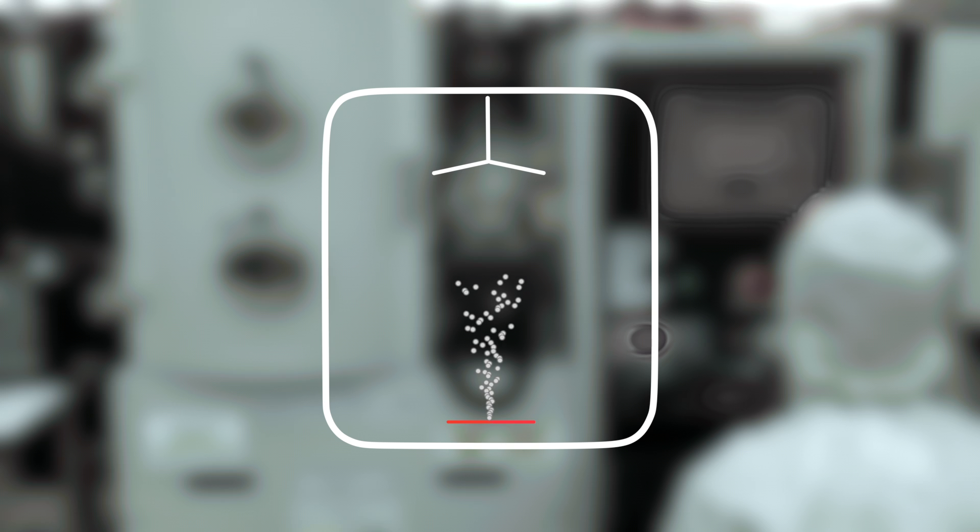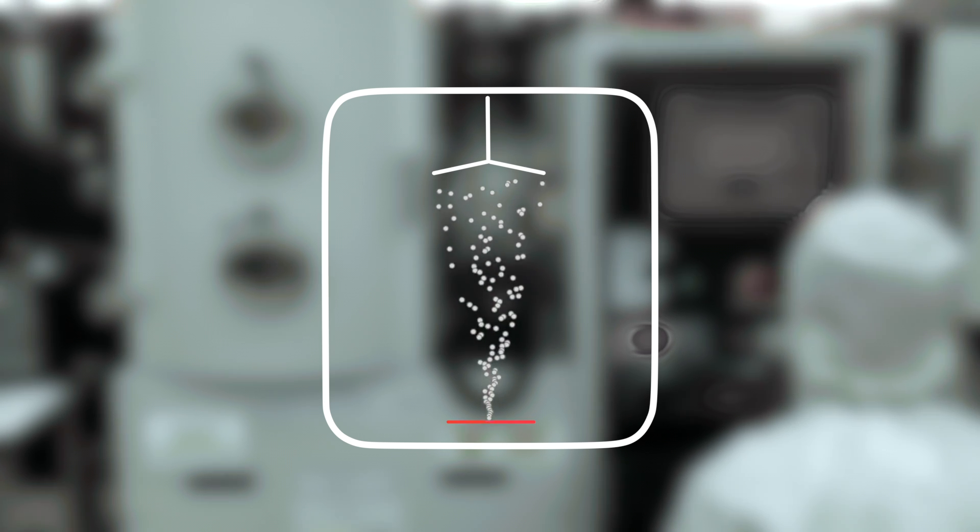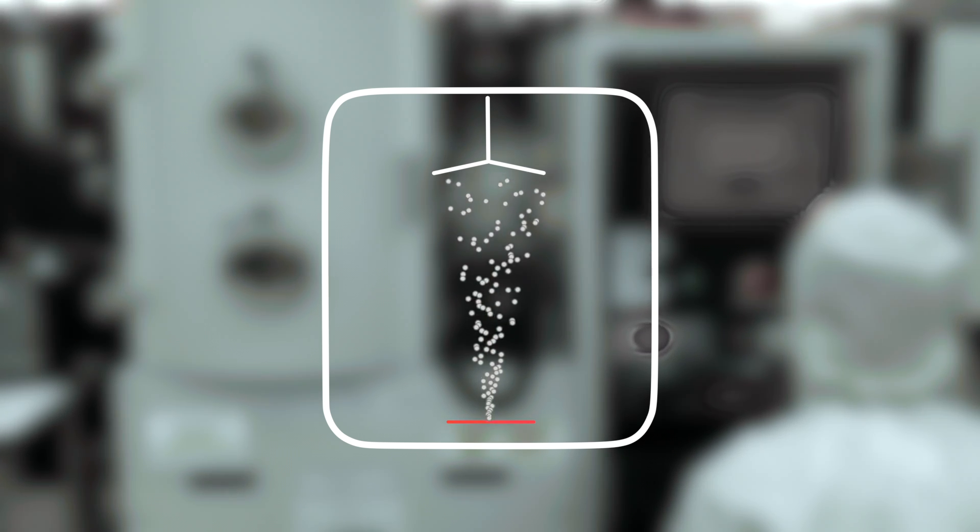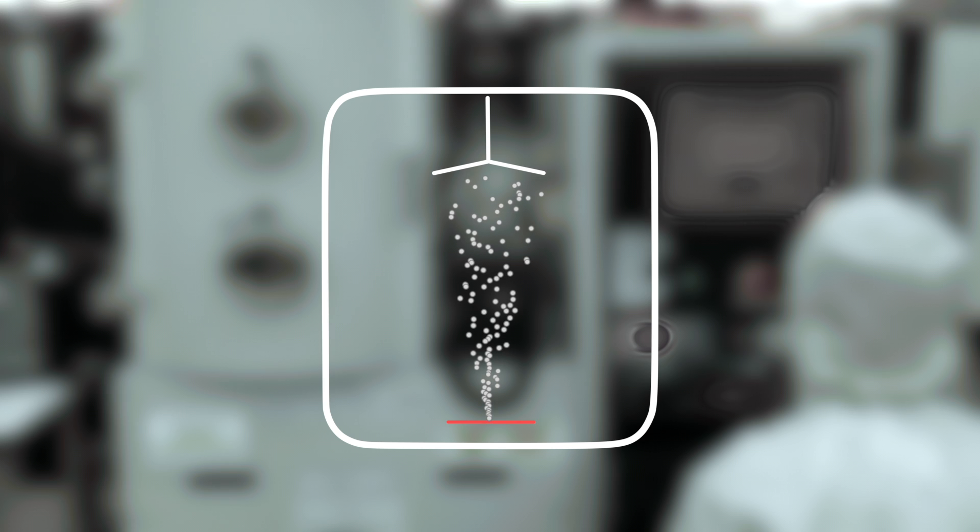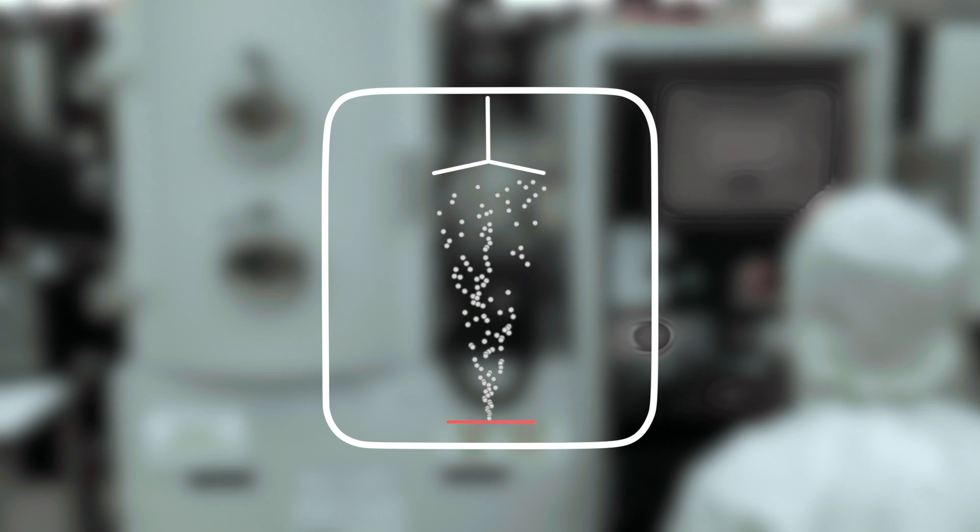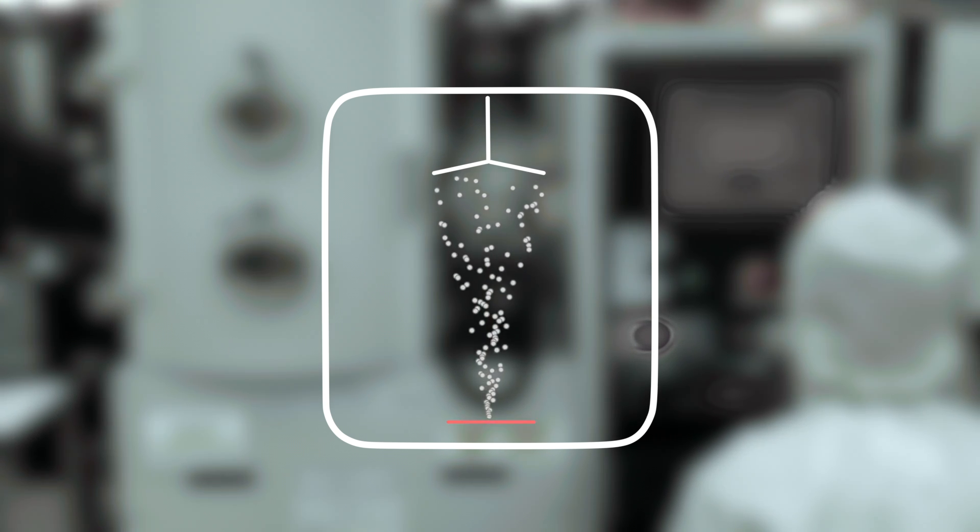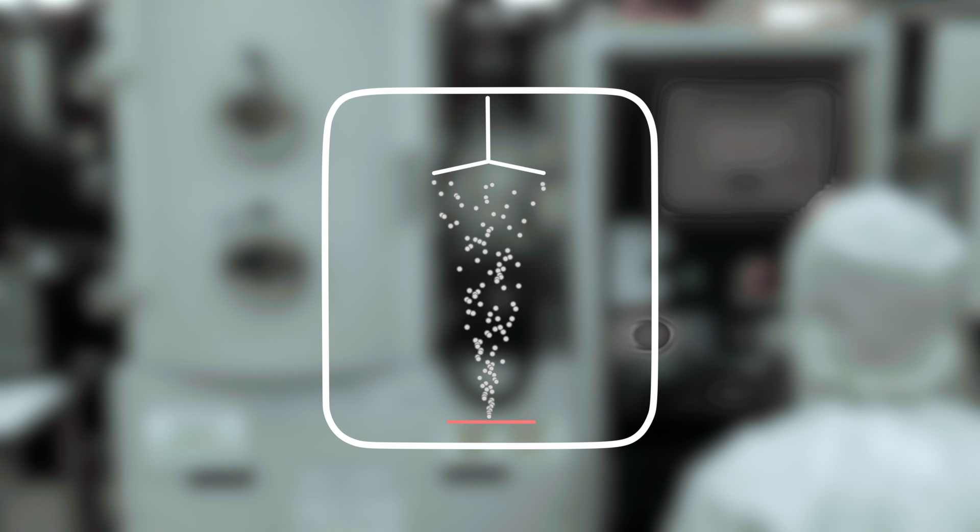Then the metal is heated to the point of vaporization by high intensity beam of electrons. This causes the metal to evaporate and the metal molecules travel in a straight line to be deposited onto the substrate.